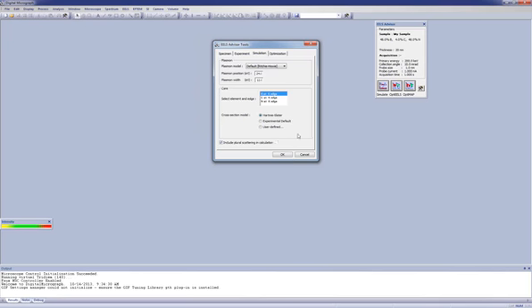But if the details of the calculation are not accessible or not important for you, you can always rely on a default set of parameters that the calculation will use. The optimization tab I will discuss later.